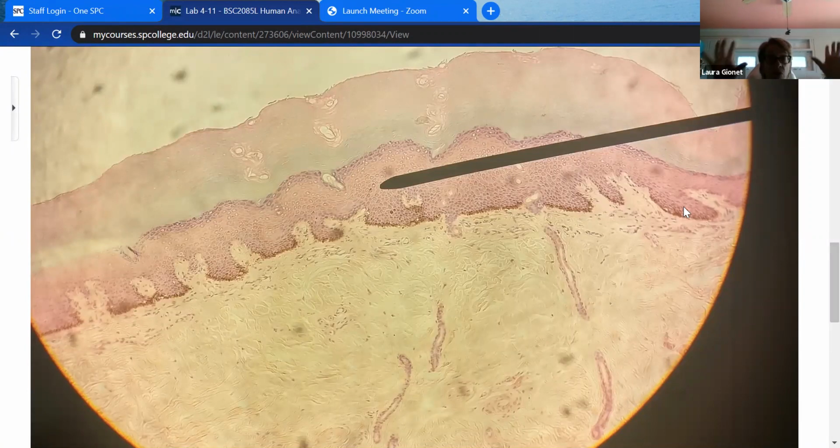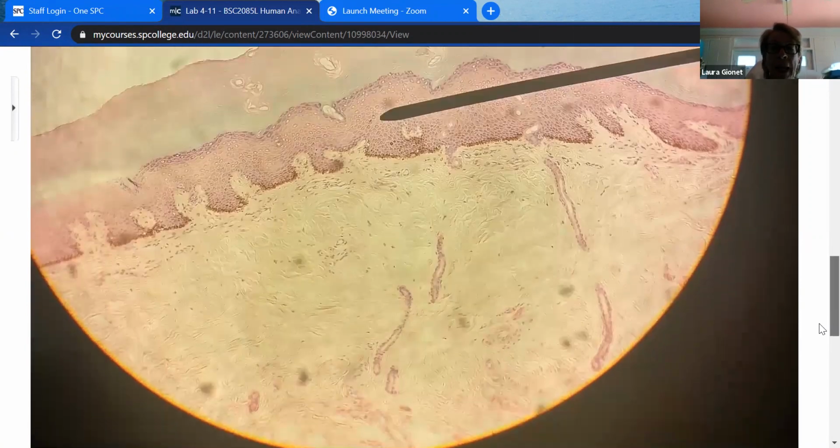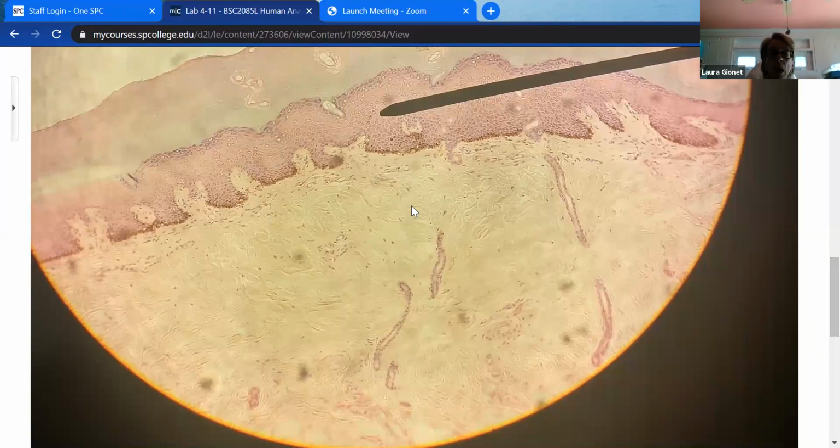This is a slide of all the skin. You just barely get into the hypodermis. From this pink undulating portion upward, even though this is the keratinized region of it, from the pink undulating wall upward, that is the epidermis. That tissue is stratified squamous epithelial tissue. That darkest staining point on the bottom, that meets with the dermis, or is adjacent to it, right? That is the stratum basale, the area of high mitotic division for all those squamous cells above.